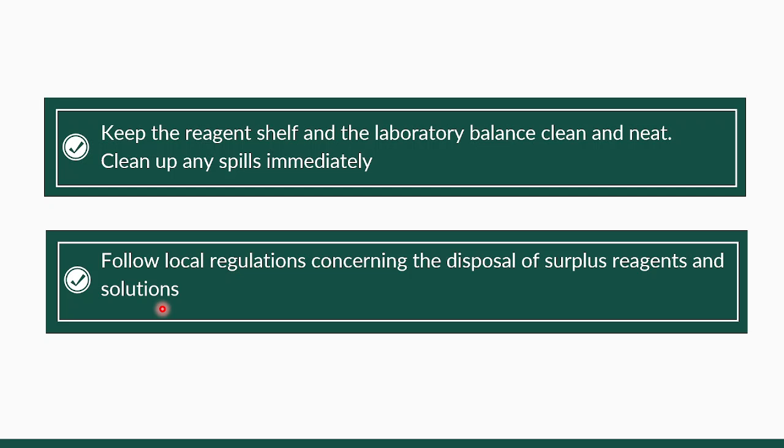So, kailangan mangutana ta sa atong laboratory in charge, no? Because they have a proper handling, proper disposal area for this one. And if ever naay mga masubra nga reagents, then maybe we can ask them if pwede ba ma-store balik sa ilahang office or sa ilahang room para next time magamit na po to sa other students.